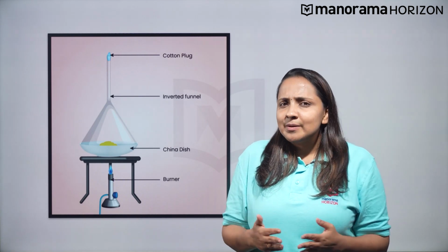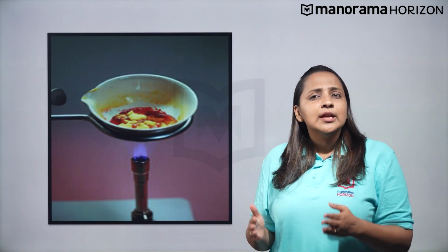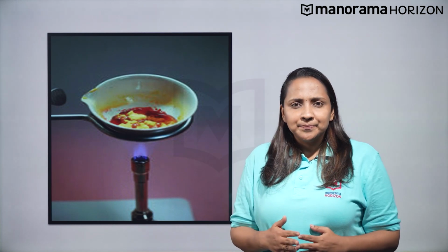Do you know why the sublimation process was not successful? It is because sulfur is not of volatile nature and upon heating it melts. Therefore, the sublimation process could not succeed.